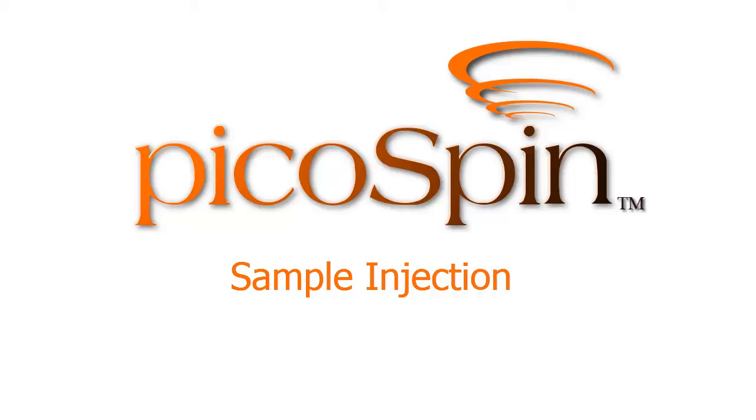The subject of this video relates to the procedure of sample injection into the PicoSpin45 NMR spectrometer. A written description of the information contained in this video can be found in the System Operations section of the PicoSpin45 User Manual under the heading titled Sample Handling.